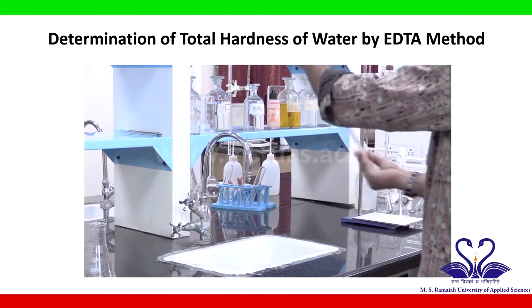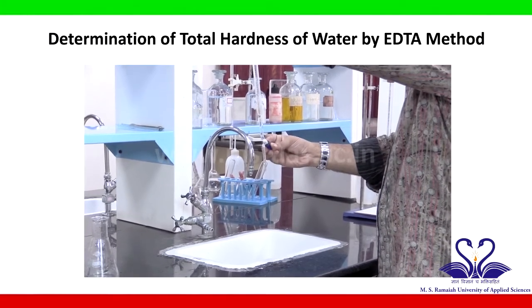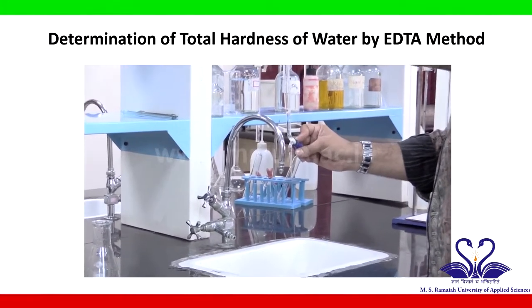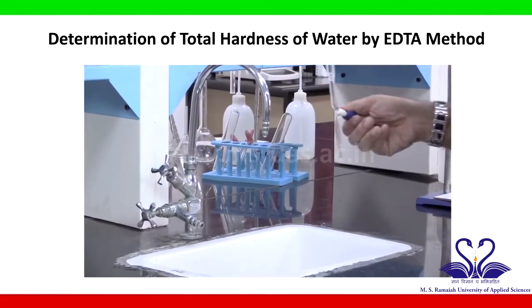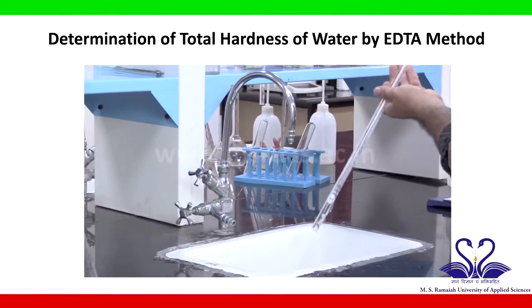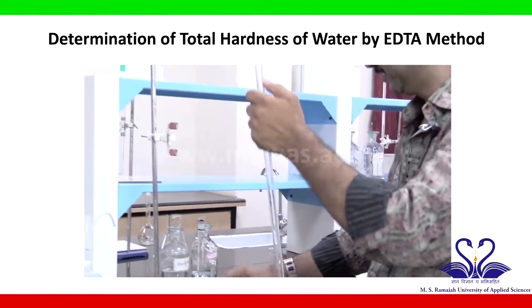Rinse it, and leave it from both the sides. Now you can fill it up and make it up to the 0.